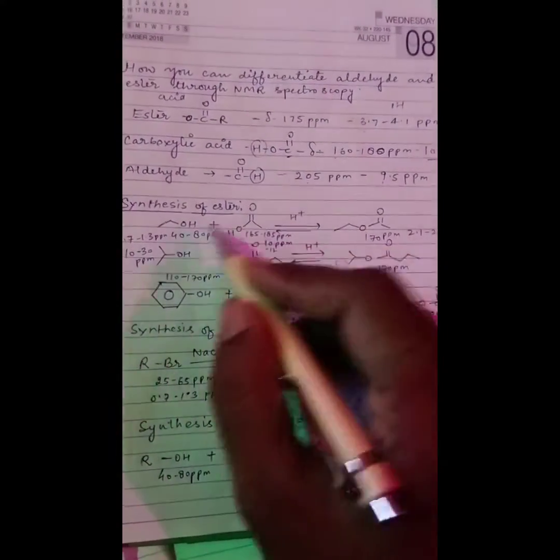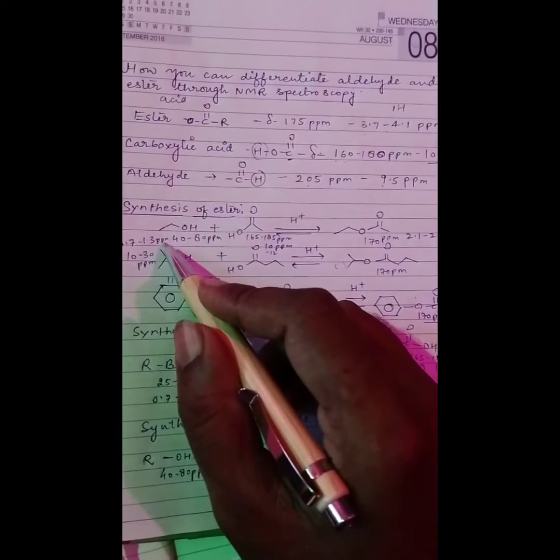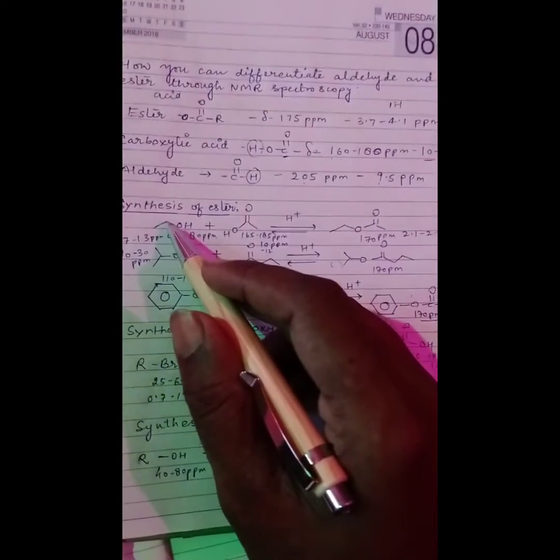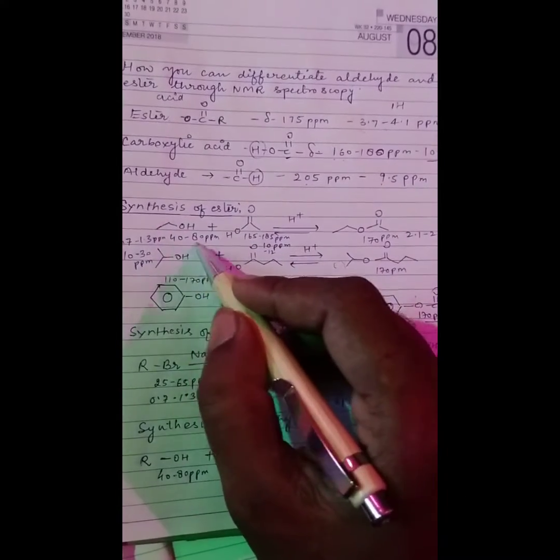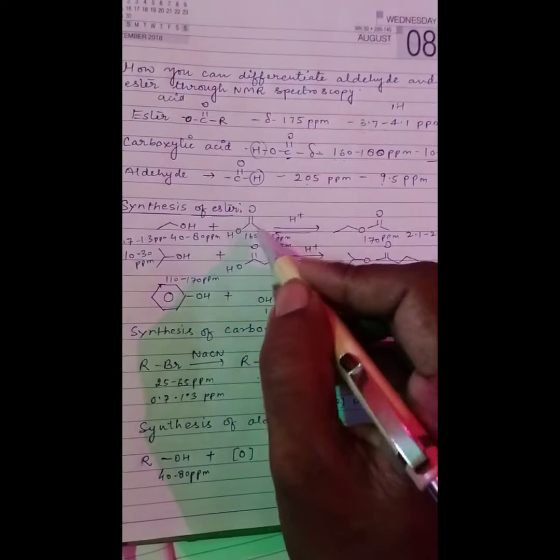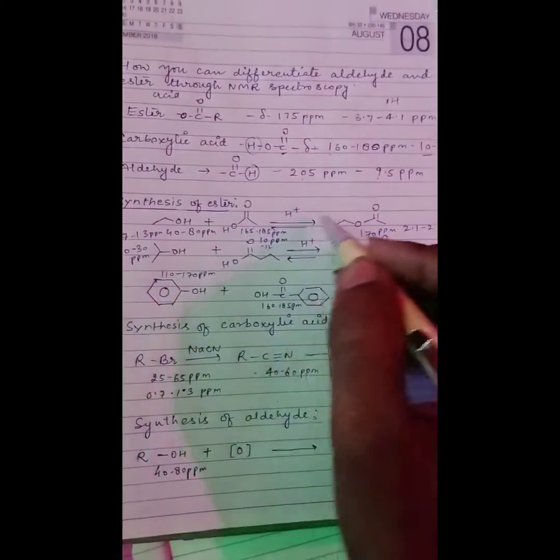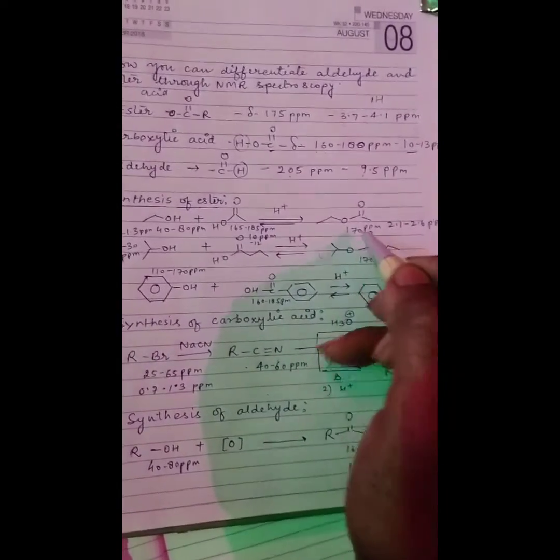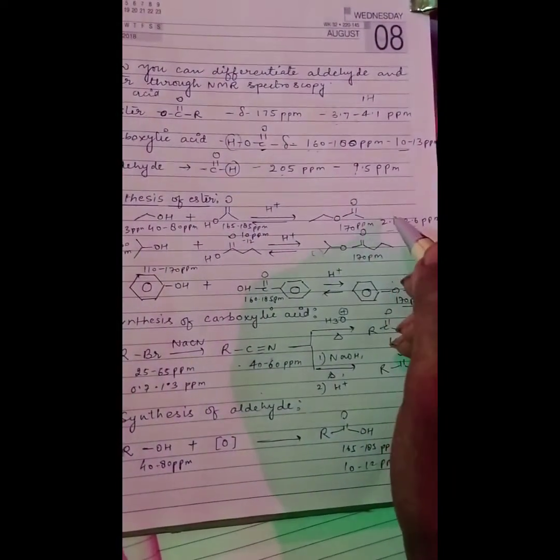In the starting material NMR, you should know that 0.7 to 1.3 ppm appears for the hydrogens, and this CH2 will appear in the aliphatic region. This carbon appears at 40 to 80 ppm. The COOH carbonyl will appear at 165 to 185 ppm. So these peaks will disappear, while in the NMR spectra new peaks will appear at 170 ppm in C13, and at 2.1 to 2.6 ppm in the aliphatic region. So these peaks disappear and these new ones appear.